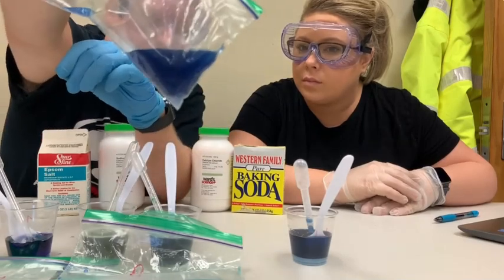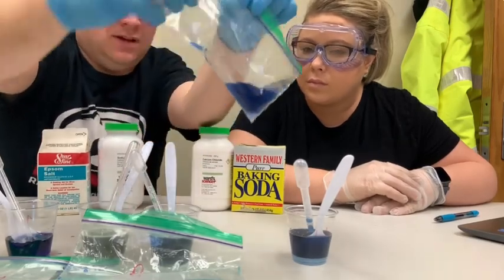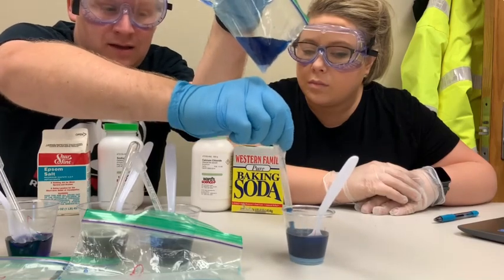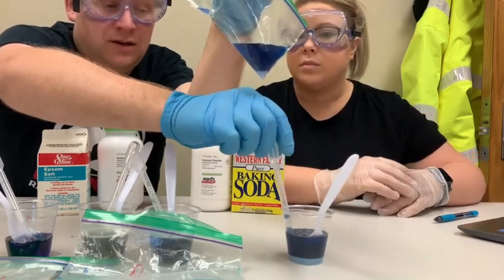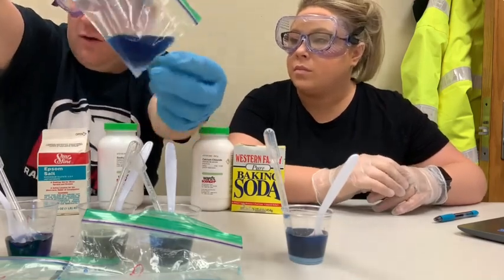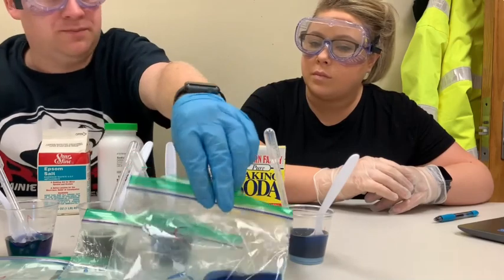There's a little bit of white powder at the bottom, but that's because when I use the pipette here, I grab from the remaining baking soda down at the bottom, so that's what that solid is there. So there is no precipitate formed during this one.